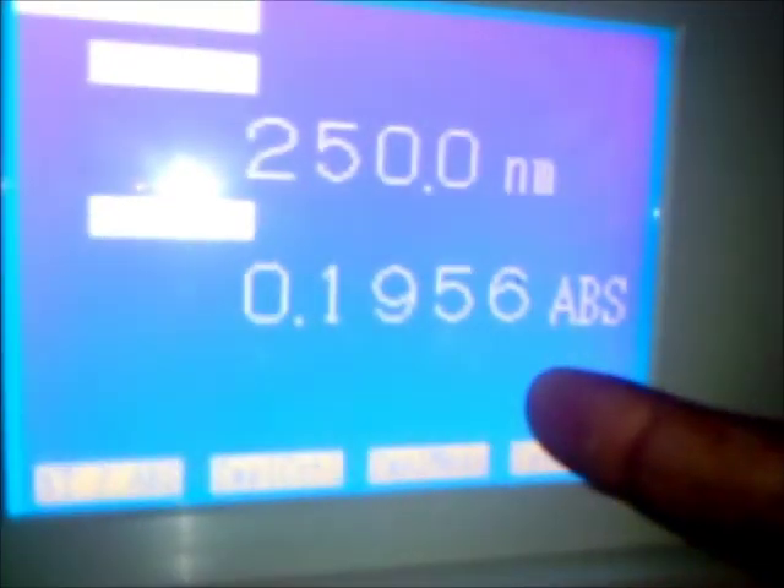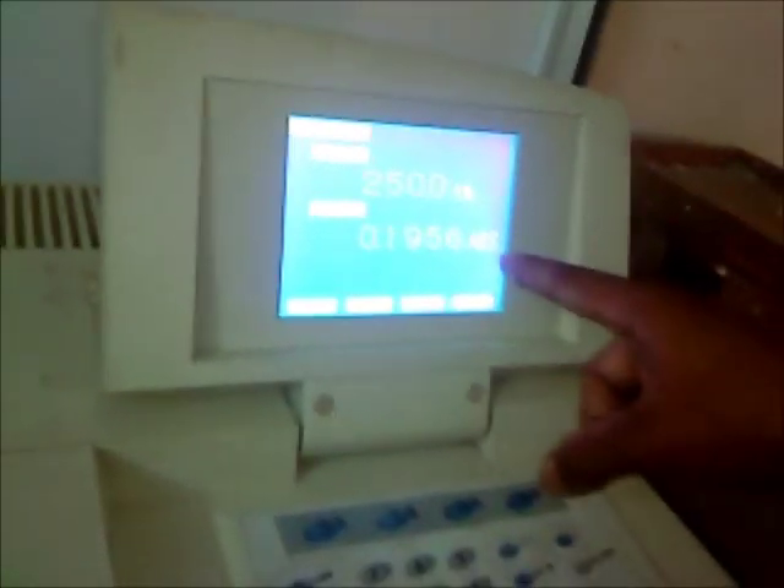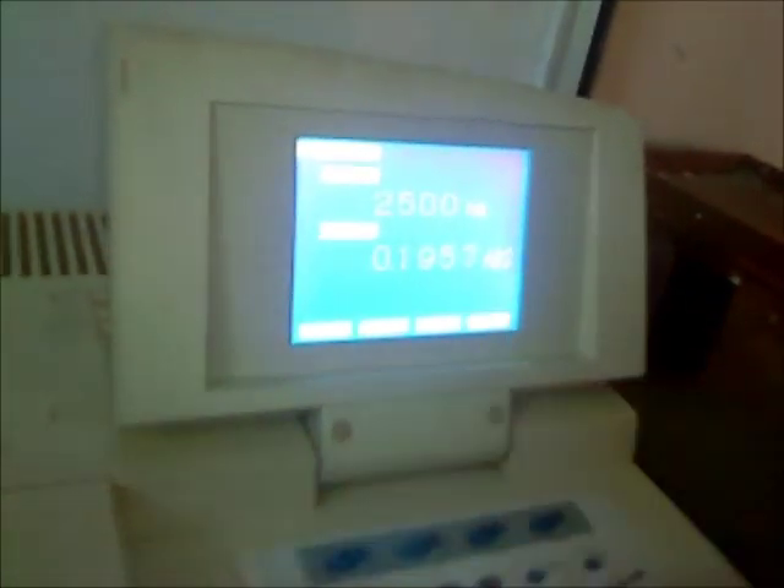Note down the absorbance — this is the absorbance: 0.1956. Simultaneously note down the absorbance and one by one transfer the sample into the cuvette and note down the absorbance. These are the total procedures for handling the cuvette on the SHIMADZU 1700.